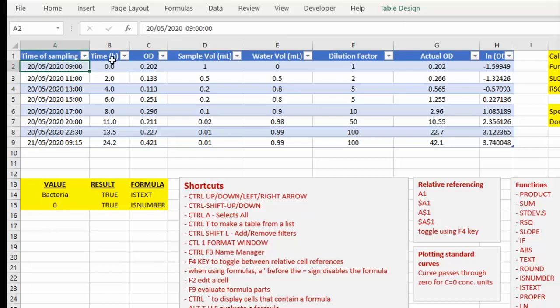So that's 43,000 days. And then the 0.375 is because Excel calculates this 9 hours: 9 divided by 24 is 0.375, a fraction of a day. That's how Excel's day starts from 0 at midnight and ends at 24 hours, or 11:59, which will be 1. So the values are between 0 and 1 for any fraction of the day.